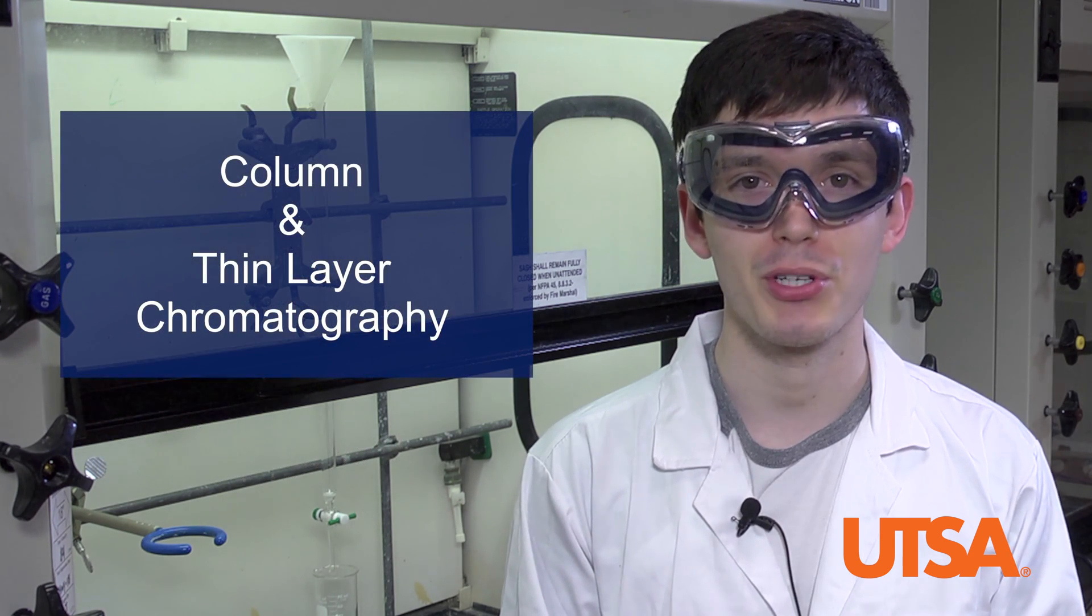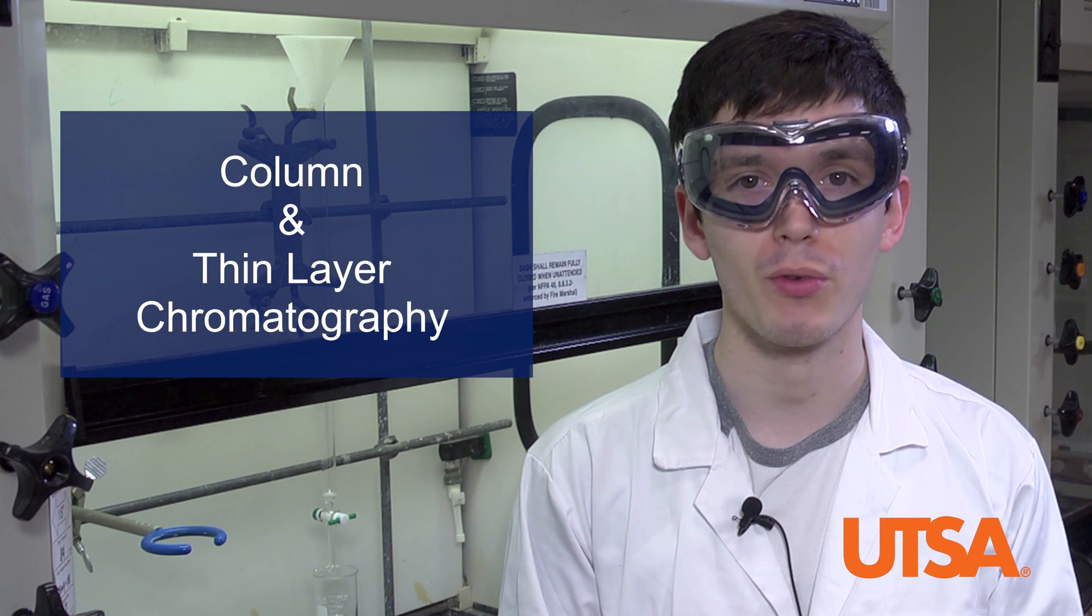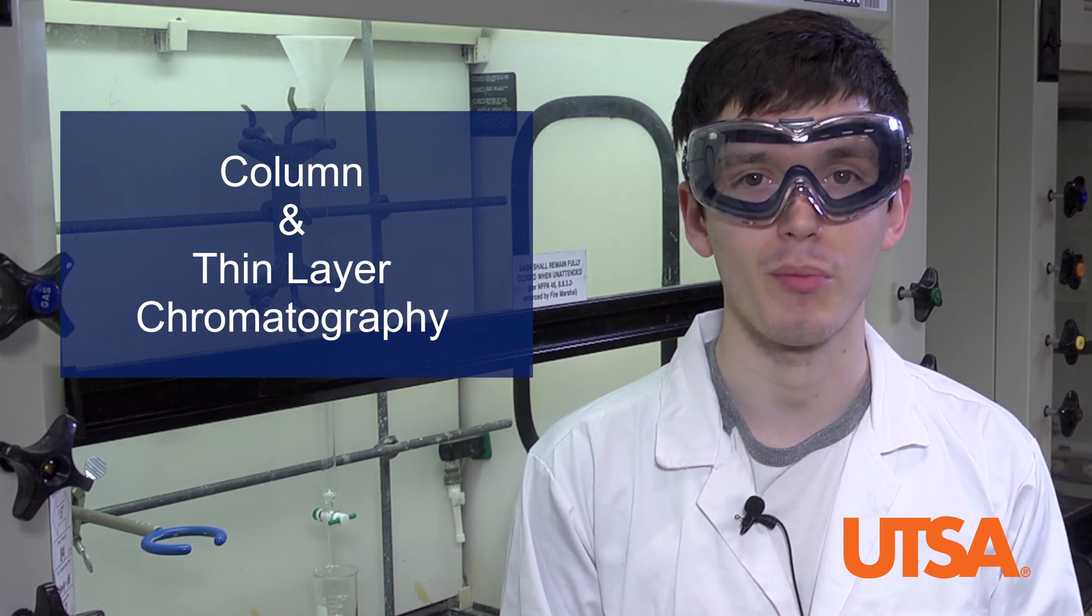Hello, my name is Matthew Randall and I am a student at the University of Texas at San Antonio. Today, I will be showing you how to perform column chromatography and thin layer chromatography.